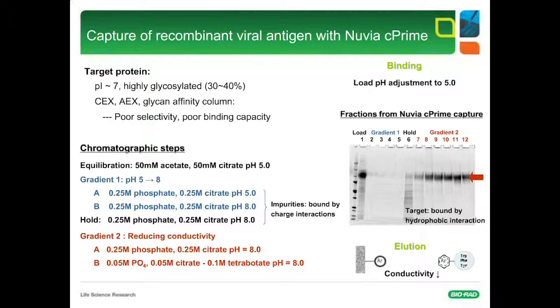I also have another question: do you have mixed mode phases for small biomolecules? I'm not sure what they mean by small biomolecules. It'd be nice to know what range of molecular weight you're talking about. But as long as you have a molecule that has some proteins in it, so some range of amino acids, you could think of these as potentially HCPs. These are also small biomolecules. So you can get a resin like this to operate on anything really.